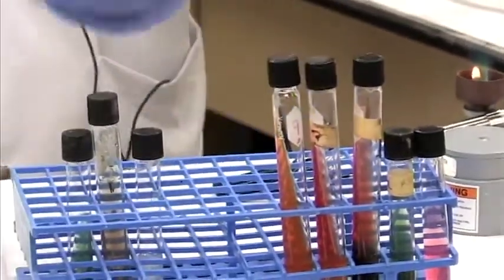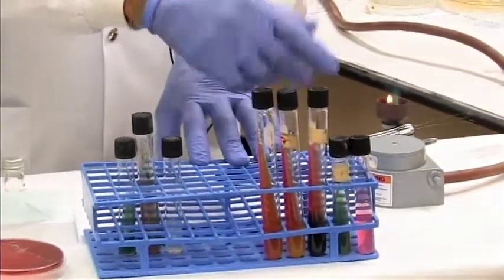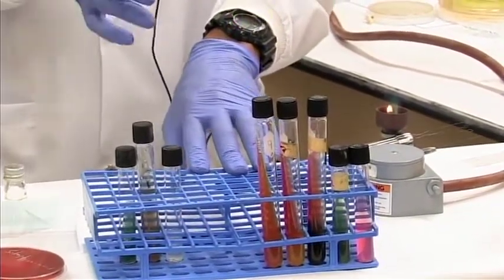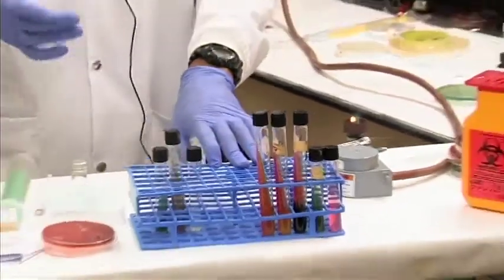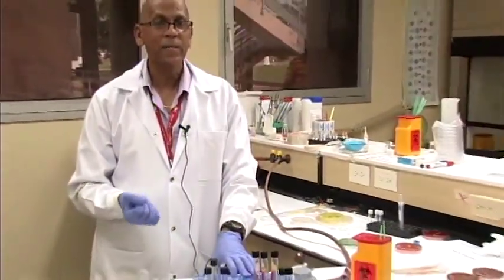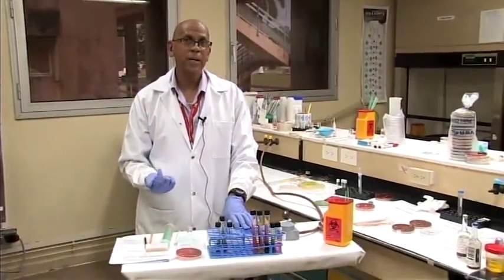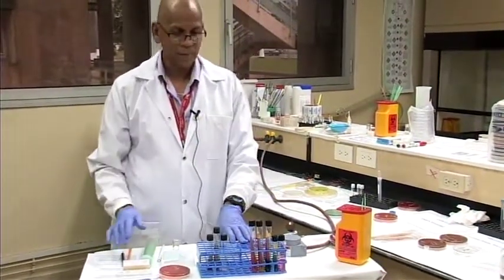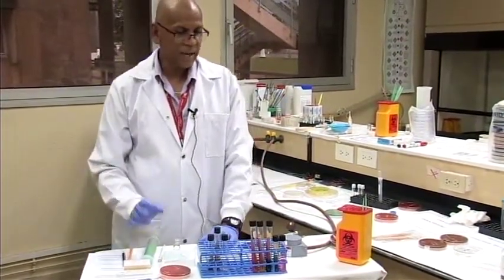Then we'll go to a chart. We have what we call an identification chart, and list these reactions and compare the reactions to distinguish what bacteria we have, namely members of the entire Enterobacteriaceae group, like E. coli, Salmonella, Shigella, Klebsiella, and so on. Those are the bacteria we use these biochemical tests for. So that's the end of biochemical inoculation.